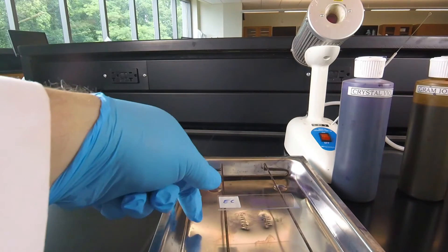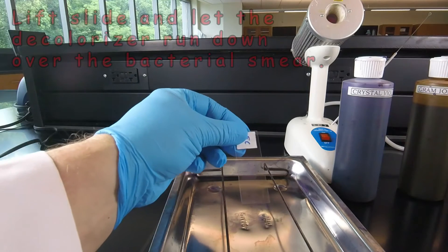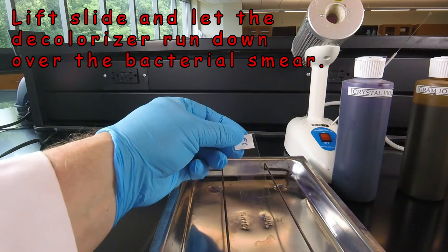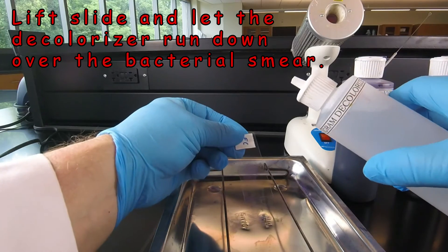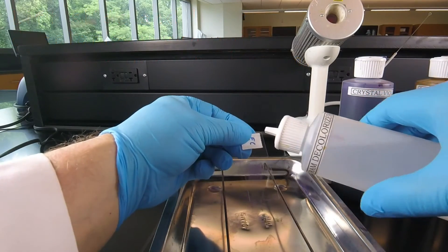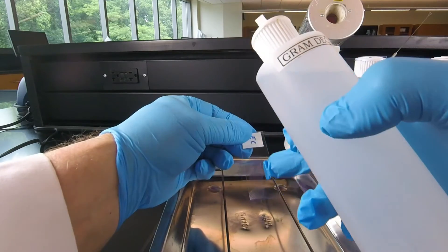So when we're ready to decolorize, we again pick up the slide, we hold it at an angle over the staining tray. We're going to take our decolorizer and run it back and forth over the slide above the smear and let it run down over the smear.